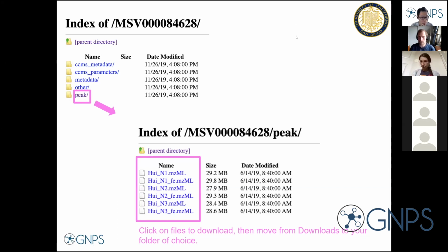All right. Thanks, Allegra. I just saw that there was a question if there is a good way to download them all together. And the short answer is yes. So you can either use basically that FTP link and connect through an FTP client, such as WinSCP, or for the Windows user, you can just copy and paste that entire link into your Explorer.